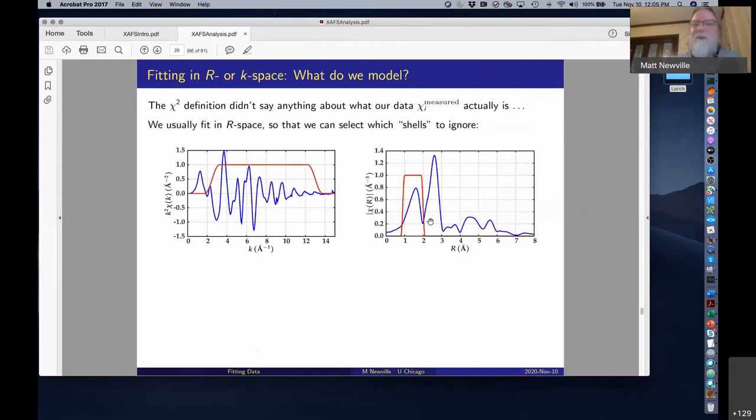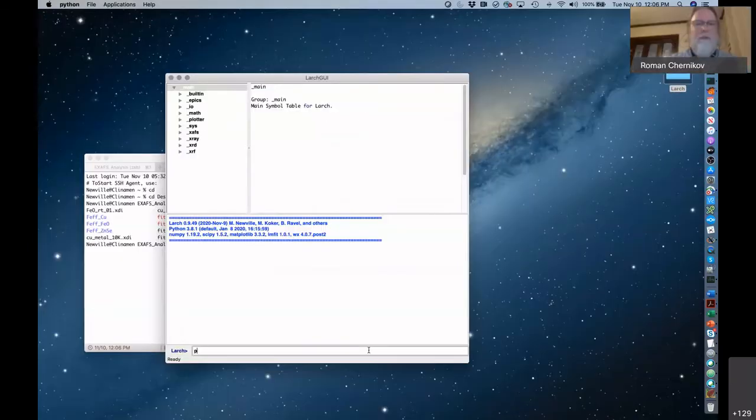it's only off by an order of magnitude, I'll say that. So it's the right scale-ish, and for most decent data it's off reliably by a factor of 5 or so. So the chi-squares are more like in the 20s to hundreds than in the ones or in the millions. But it's about right. It's not terribly right. And what it misses is the systematic errors at low R that are probably dominated by the poor background subtraction.